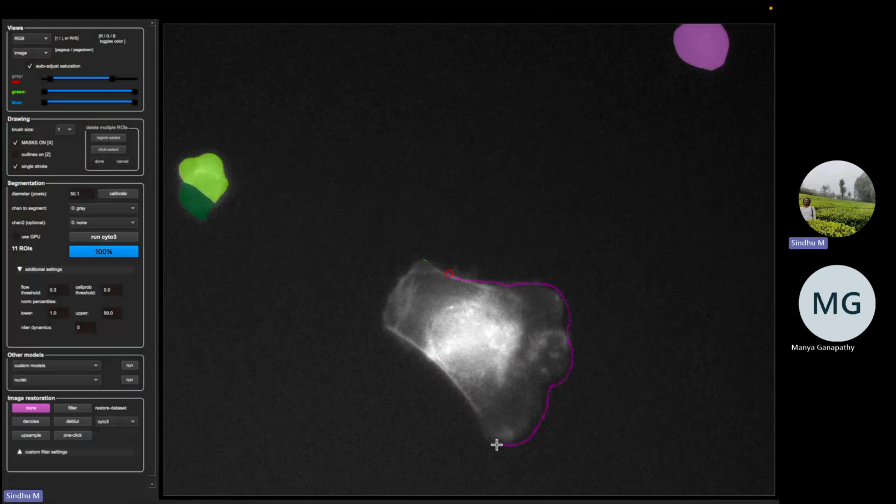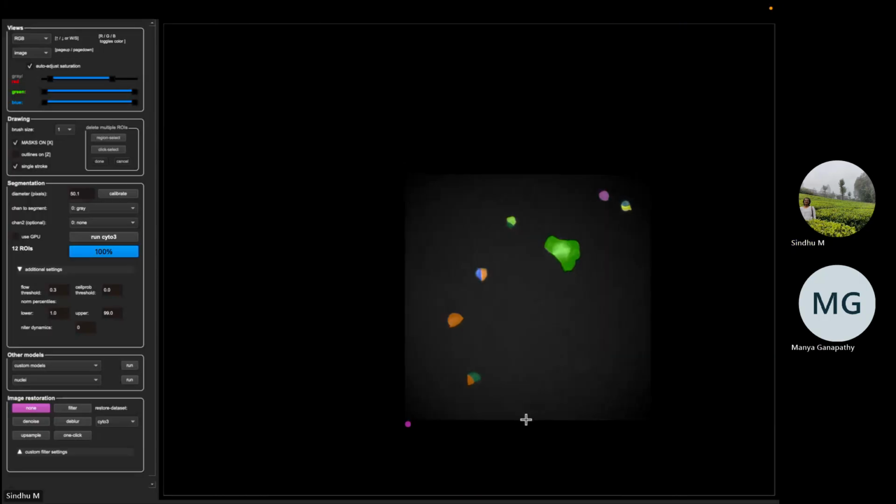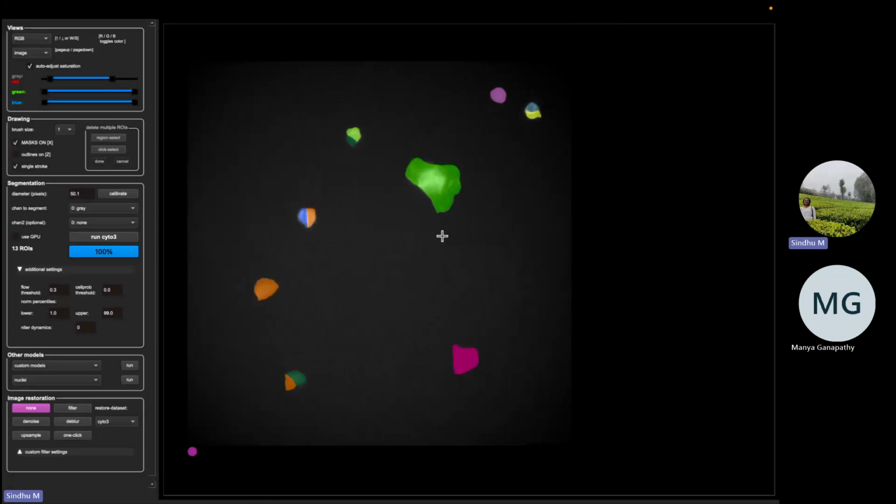For Windows, if you're using a normal mouse, or even for Mac, if you're using a normal mouse, you have to right click and then it will show you that red circle. And then you can just move your mouse to draw the outline. And when you come back to the red circle, the mask will finish and it will be created. And also this one. Yeah, so now it has created these two masks.